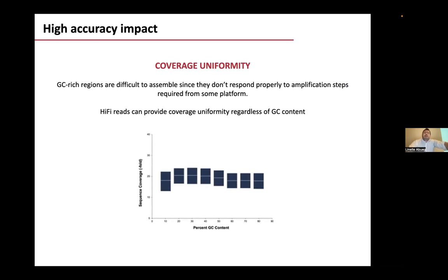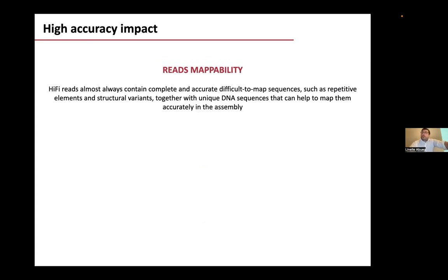The GA bias. So there are some regions of the genome that PacBio has a little bit more trouble going through. They call it the GA bias, GA, GGA, or whatever. But it's pretty minor compared to the GC bias in the webinar. And it's just a template that the polymerase struggles with. When you do super long reads, the polymerase can fall off this template because you're creating secondary structure or something, but you still get a long read, right? But for HiFi, because you have to go back multiple times, you have more chance to fail, and then you fail and this read doesn't exist. So that's why you have a loss of coverage.